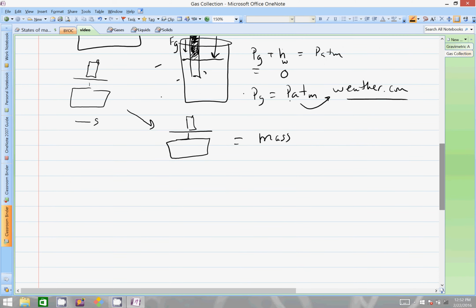Okay. Now, molar mass is grams per mole. You will have the mass of the liquid that you just dispensed. Okay, that's done. Easy to do. But how do I get the moles of particles inside there? We're going to gather that from PV equals nRT.